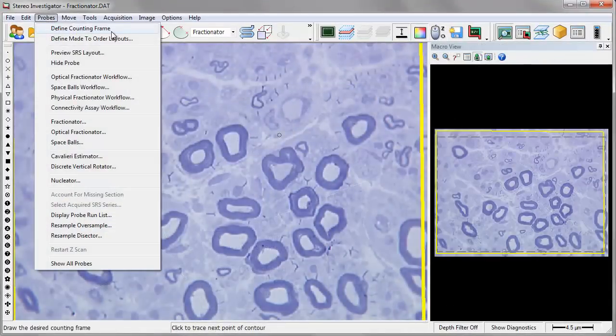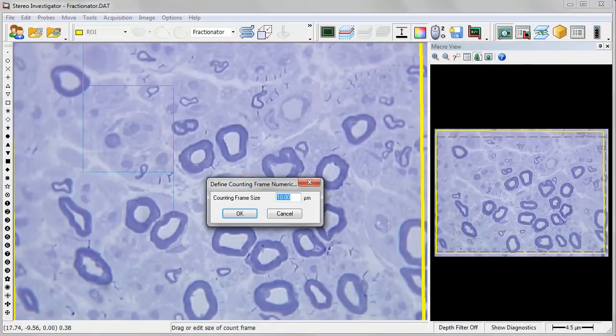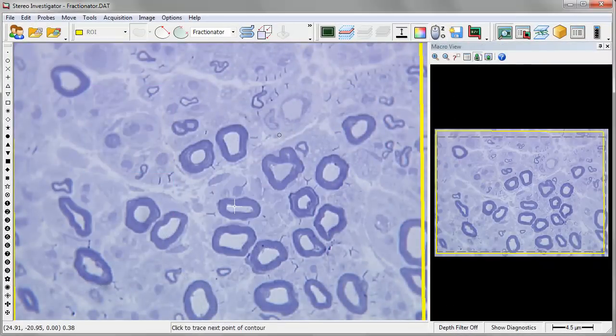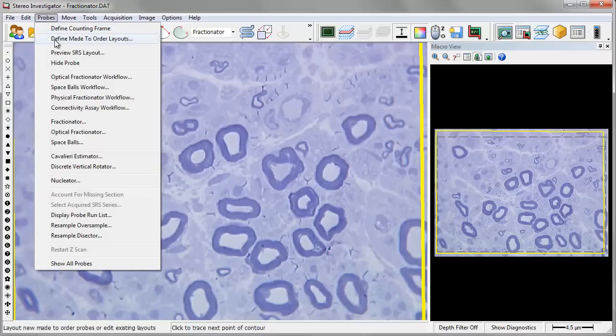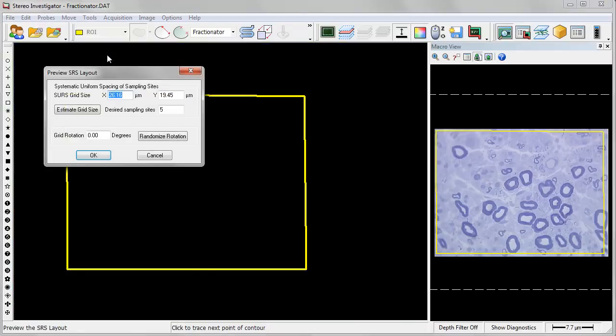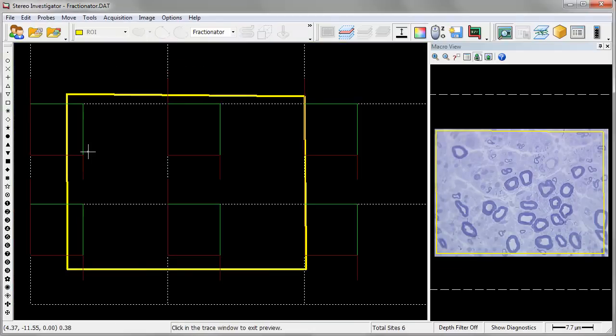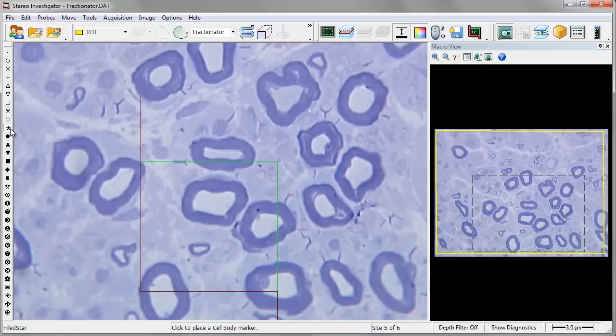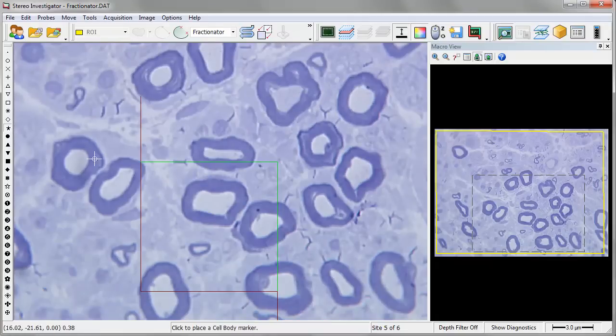The fractionator probe is most commonly used to estimate population counts in cell cultures and population density in pairs of 2D images or virtual slides, as well as to select random distributions of objects to analyze with other local probes, such as, for example, the nucleator.